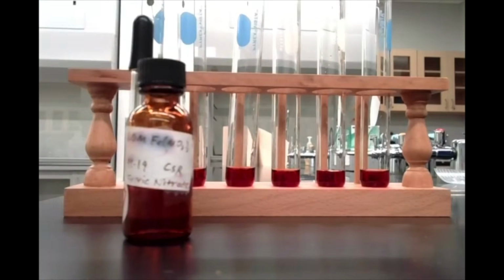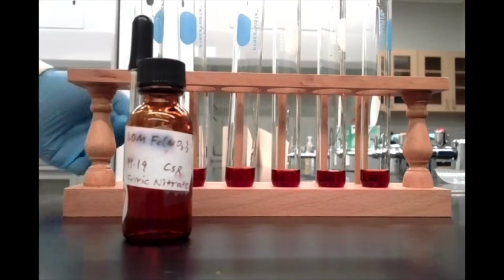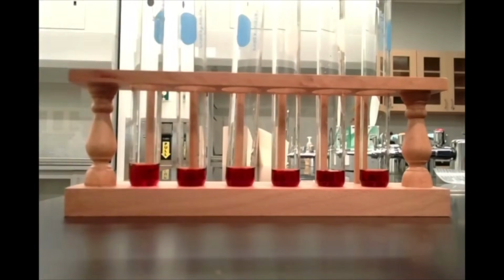So think about how that might affect the equilibrium between our individual ions of iron 3 plus and thiocyanate on the left, the reactant side, and our iron thiocyanate complex on the product side of this equilibrium. All right, let's go ahead and add our 10 drops of iron 3 plus solution to this.